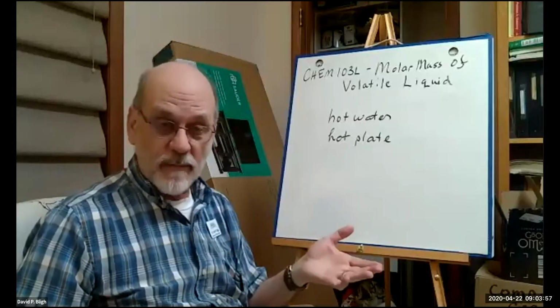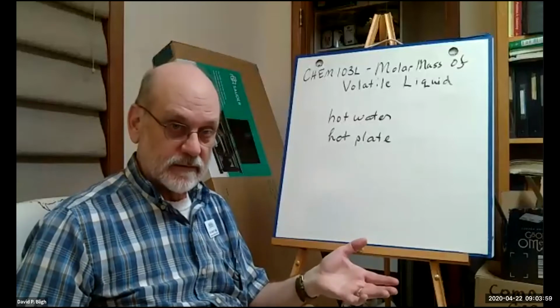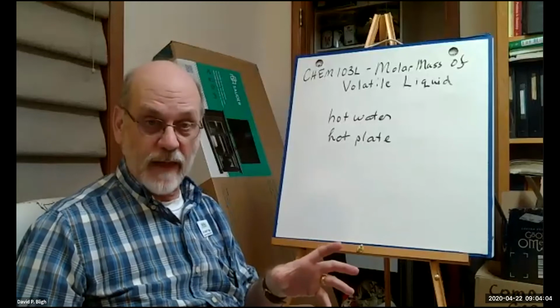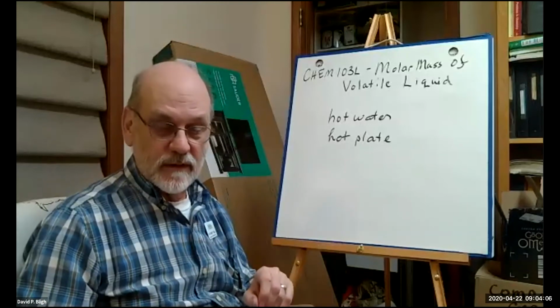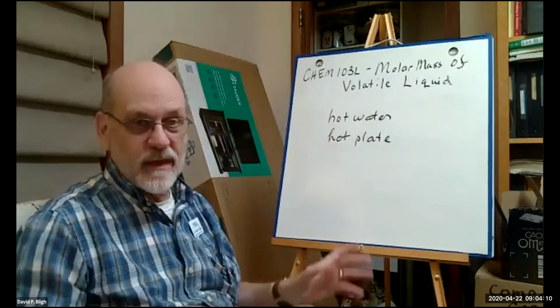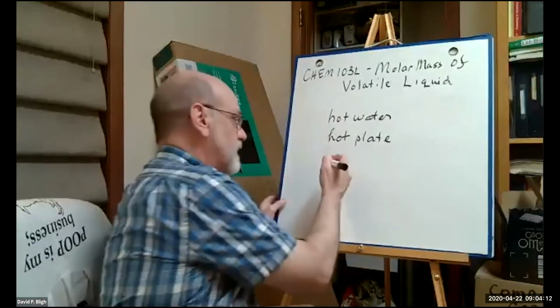And these are organic compounds, so what does that mean? That means they're flammable. So the liquid's flammable as you dispense it, and the gas is flammable as it escapes. So you don't want any open flames anywhere near these. Flammability.